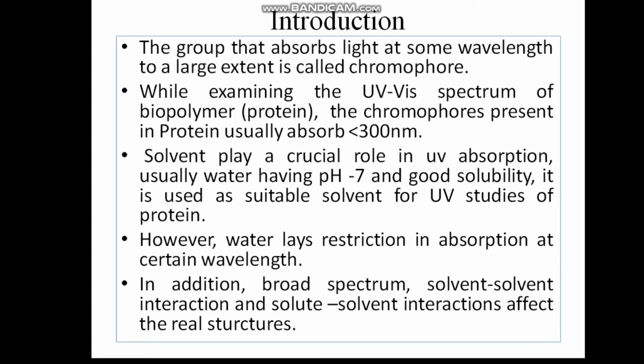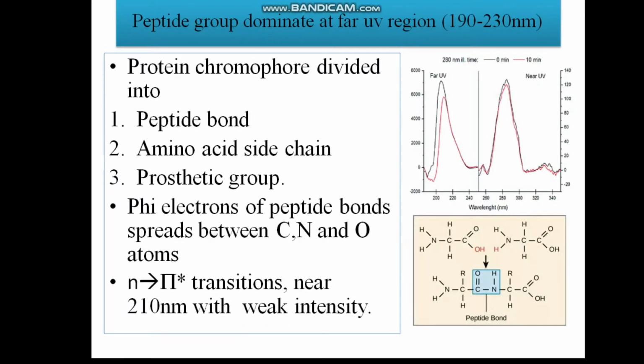Because of these things, sometimes the real structure of the protein may to some extent be affected by the solvent, exclusively water. Having given that idea, we can now inspect the protein in a UV spectrum.